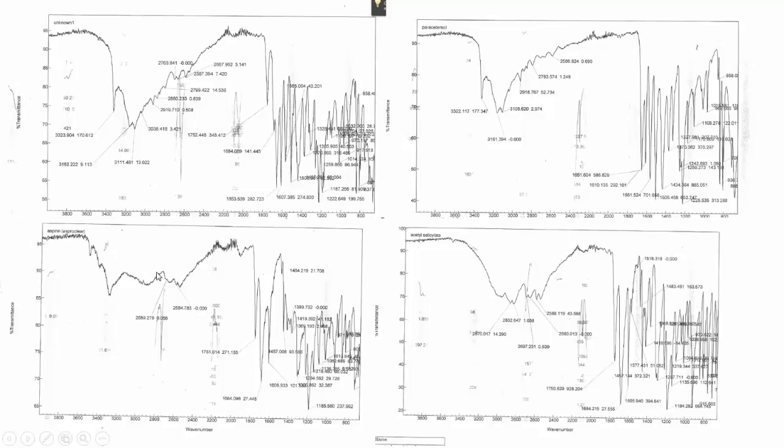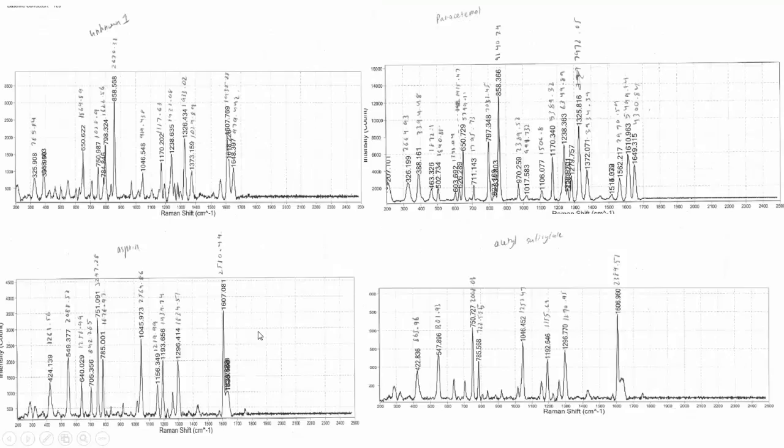There is a peak at 1752, which matches with the CO carboxylic acid peak. The Raman shows a fairly exact comparison with paracetamol, but not as strong with the other spectra. As you can see, many of the peaks are the same for the unknown one and paracetamol, such as 858, 1238, 1326, and many others, but not so much for aspirin and acetyl salicylate.